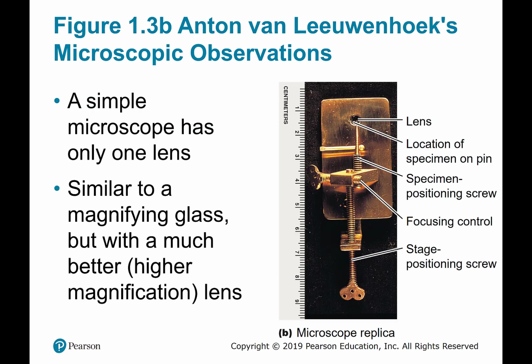We are going to talk about various types of microscopy, and in this image, this is showing you Leeuwenhoek's microscope, which I believe I said it had a magnification power of 300x. Leeuwenhoek's microscope would be most similar to just a simple hand lens, something maybe your grandmother would use to read the newspaper. So it's just one magnifying lens. Okay, so similar to a magnifying glass. His scope, Leeuwenhoek's scope, of course, had a way higher magnification power than your just hand lens.